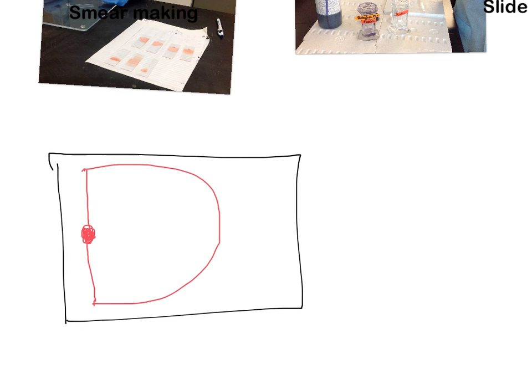When reviewing your smear, you look at the feathered edge because it's an area of perfect cell distribution. You want to look from the thick end toward the thin end in the feathered edge — specifically about a fourth to a fifth of the way in from the feathered edge. That general region is where you'll start doing your differential.